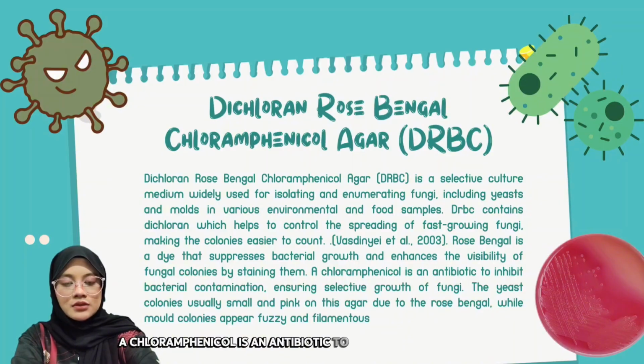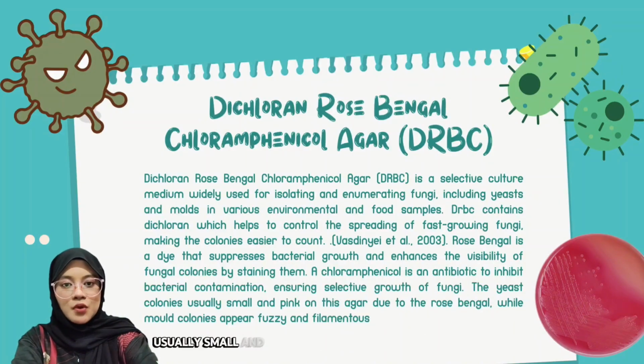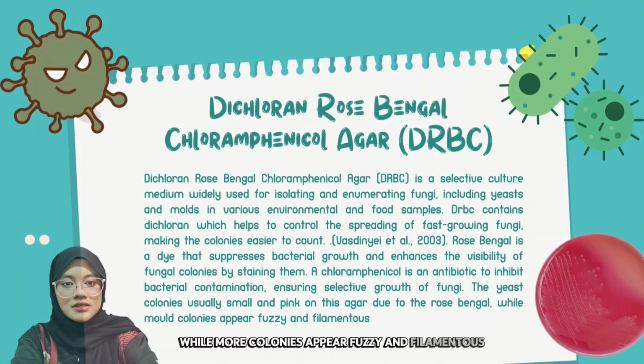Chloramphenicol is an antibiotic to inhibit bacterial contamination, ensuring selective growth of fungi. The yeast colonies are usually small and pink on this agar due to the rose bengal, while mold colonies appear fuzzy and filamentous.